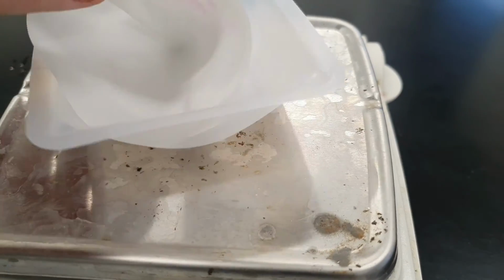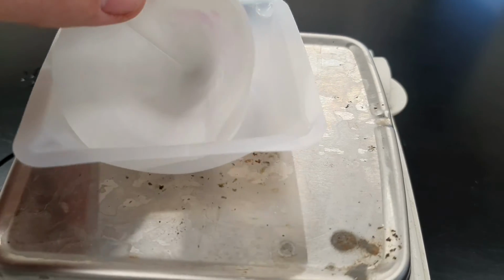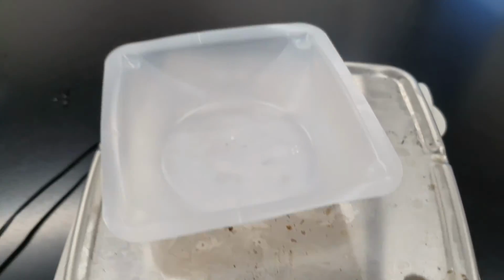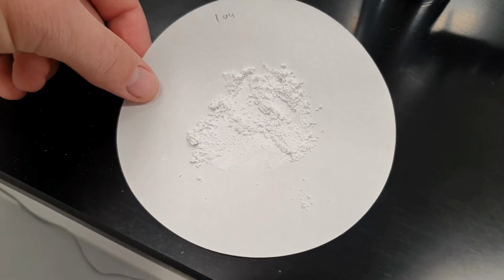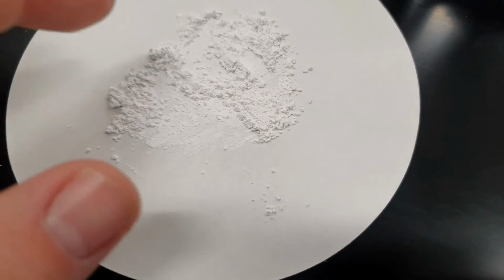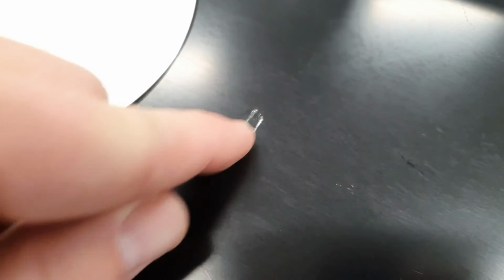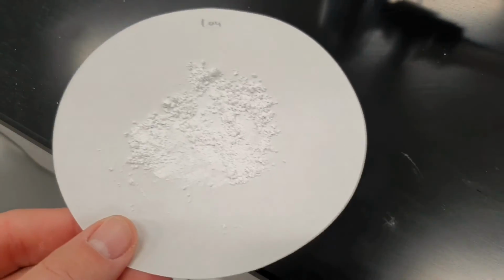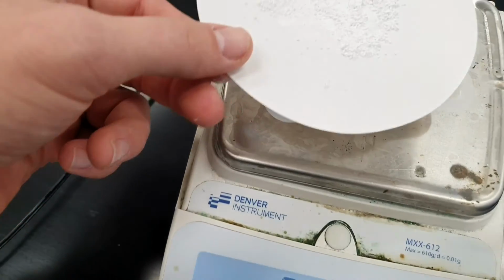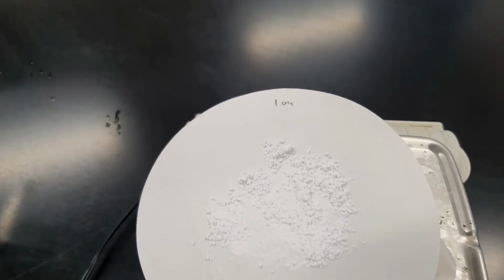Now you might be thinking, oh, this filter paper is wet, Mr. Bass, and doesn't water add weight? And I would say, well, yes, you're right. Luckily, we have a piece of dry filter paper with the same compound that I ran and let dry overnight. So this is what it would look like if we let it dry. It's really fine, powdery, and if I write with it over here, it almost looks like chalk a little bit.